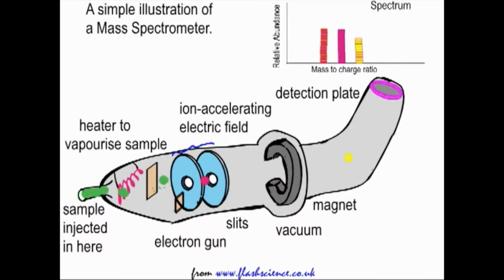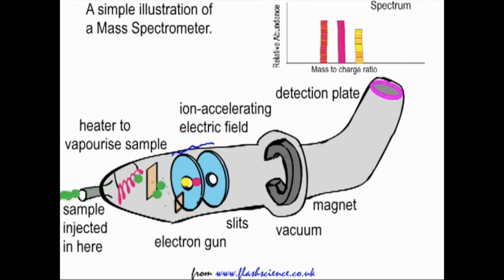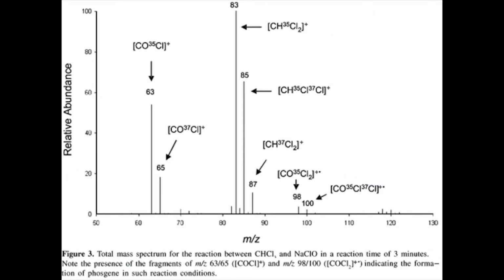The current is used to sort the ions according to how much they were deflected by the electromagnet. The ions with the greatest mass and the smallest charge are the ones that deflect the least. These results, along with the mass of the ions, are used to determine the mass-to-charge ratio of individual ions. These are then plotted to determine how many of each ratio is in the sample of the gas. Based on these results, you are able to determine the chemical makeup of the gas and what the gas is identifiable as.